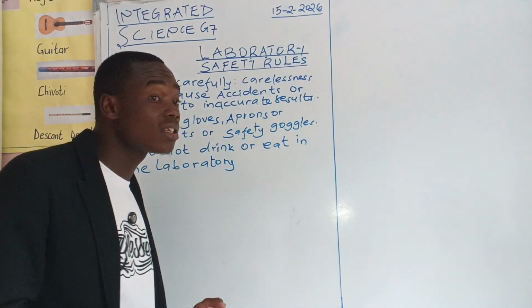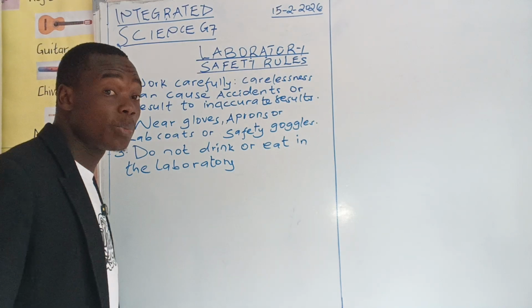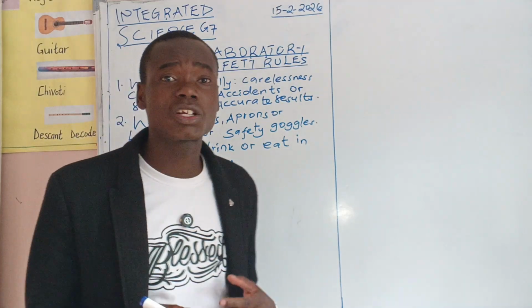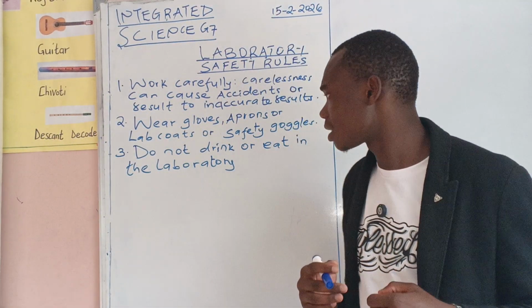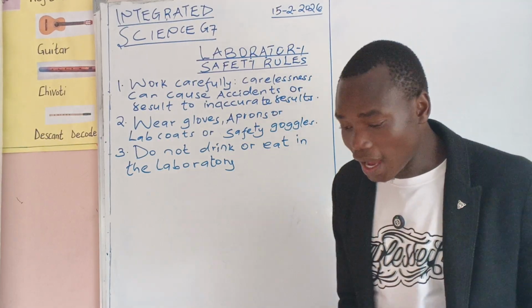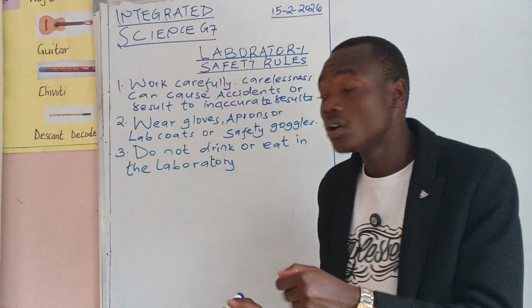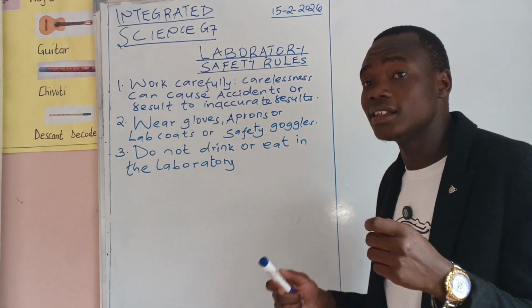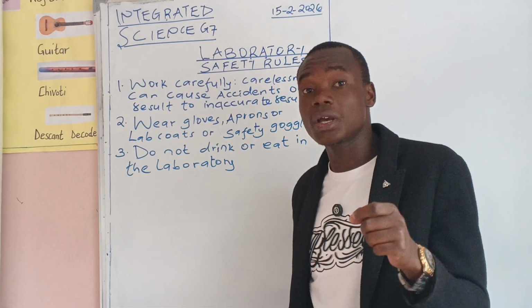with you, and the teacher is not seeing you, and you have some mandazi or chapati kept in your pocket. You decide to go to the laboratory with these food items, and upon reaching the laboratory, you are instructed to add acid to water, and you are eating and adding the acid, touching the chemicals and eating.